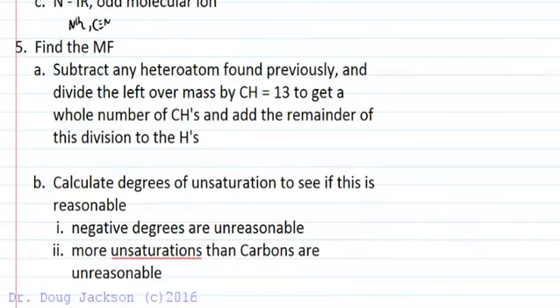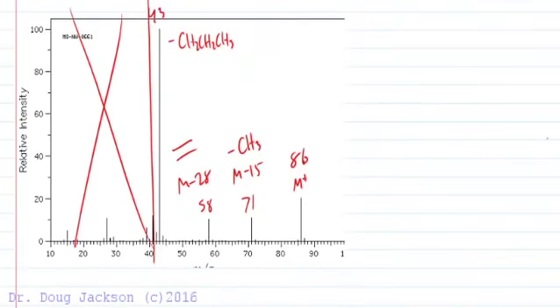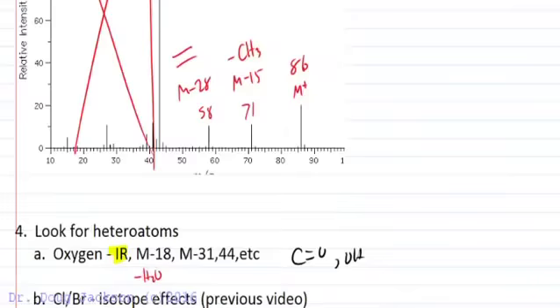So here I don't see any tremendous evidence of oxygen. This tends to happen when McLafferty happens, when there's an ester or a ketone. So we might have an oxygen in there. Let's just start with what if it's all carbon and hydrogen.